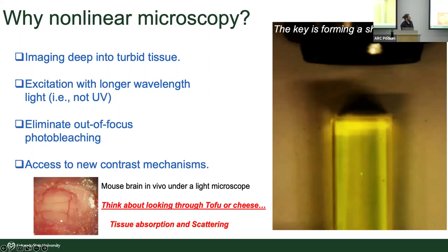In confocal, we would reject all of the fluorescence light, or at least we would try to reject all of the fluorescence light that doesn't emit from that one little spot. So what it means is, as you're scanning up here and taking your image and moving in three dimensions down, down, down, by the time you get down to this depth, that region has already been illuminated with your laser light for a long period of time, long being a relative term, of course.